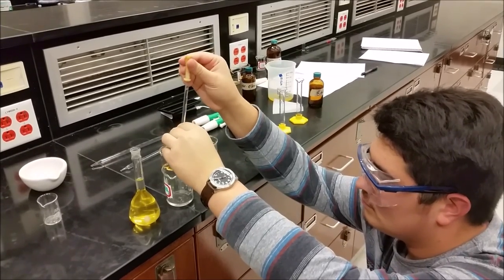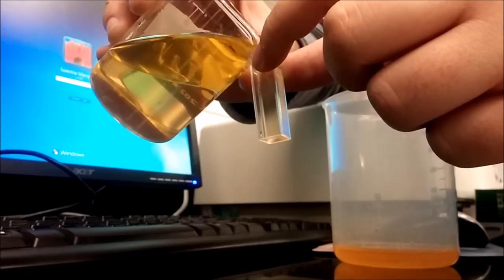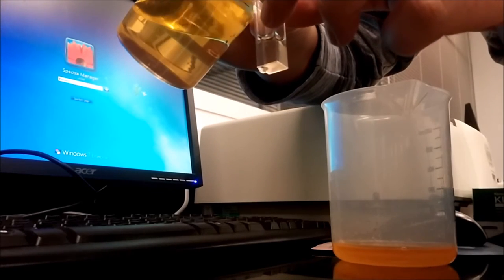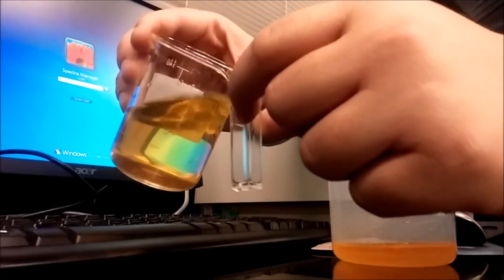Once this is done, take the solution and bring it to the spectrophotometer. Now, you can do the same things as earlier. Fill the cuvette with the solution twice, dump it twice, fill it one last time, clean it with a CHEM wipe, and place it into the spectrophotometer.